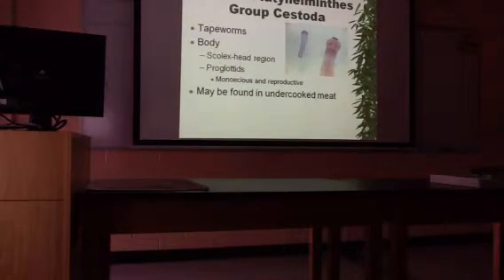And they're intended to break off from this tapeworm. Tapeworm primarily lives in the intestines of the infected organism. The scolex attaches to the lining of the intestines, and these proglottids are supposed to break off and leave with the feces. So we're talking about animals like pigs or cows that live in a field. One cow has a tapeworm, some of the proglottids break off, leave with the feces, land on the grass. The next cow comes along and eats the grass nearby, takes in the proglottids. Each one of these proglottids could attach and form its own scolex to make a whole new tapeworm.